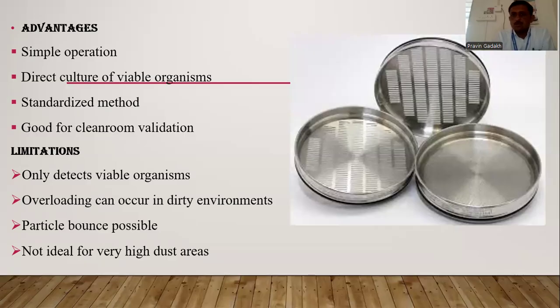If the microbial load is higher in that particular environment, we can get multiple colonies on the nutrient agar plate, so that we are unable to count the multiple colonies present on the surface. Particle bounce is possible, and it is not ideal for very high dust areas, which is the basic limitation of this particular method.